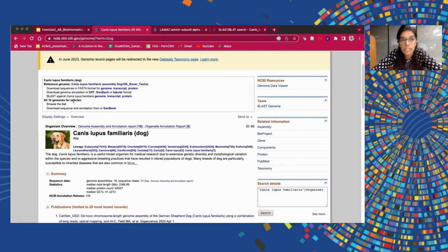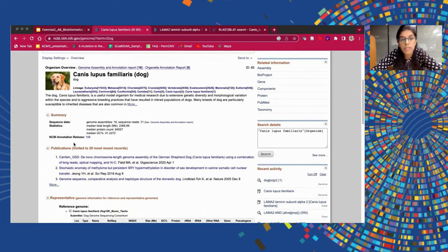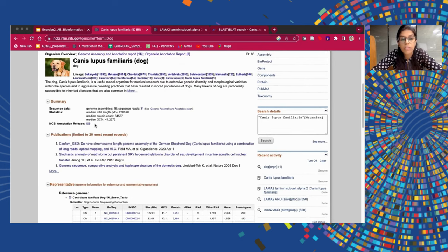There are 16 more genomes for the same species which are also available to download. If you scroll down, there are other statistics like the number of genome assemblies, the total median length of the genome, the median GC content — all these details are mentioned in the summary tab.